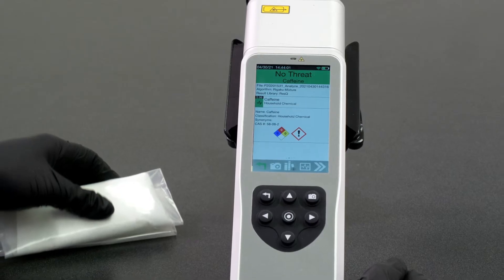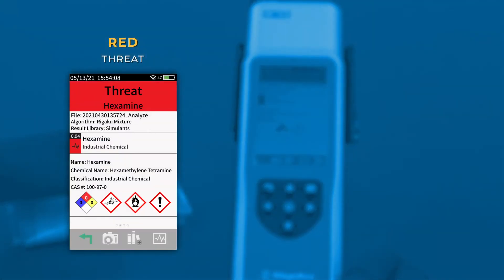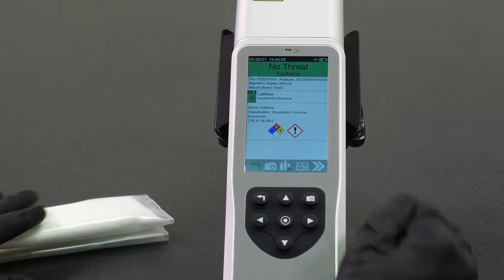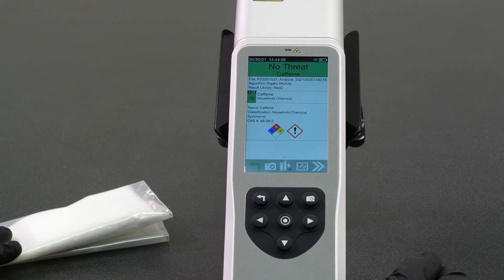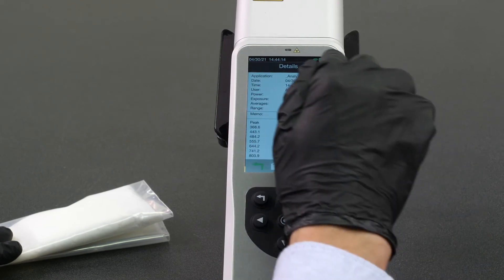In this example, we have a match for caffeine through packaging. The results screen will signify a threat with a red display, a non-threat with a green display, and a controlled substance with a yellow display. From this screen, I can interrogate the answer further by swiping left and to the right to see the resulting spectrum, more detailed information about the scan, and the resulting PDF report file.